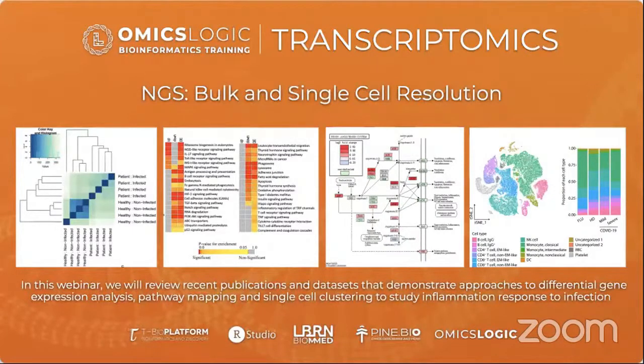So the underlying data required for performing a transcriptomics data analysis, as you would have guessed, comes from next generation sequencing. Let's talk about NGS and what it represents in transcriptomics data compared with the other techniques, and also get a brief introduction to how mRNA abundance or gene expression abundance has traditionally been measured.